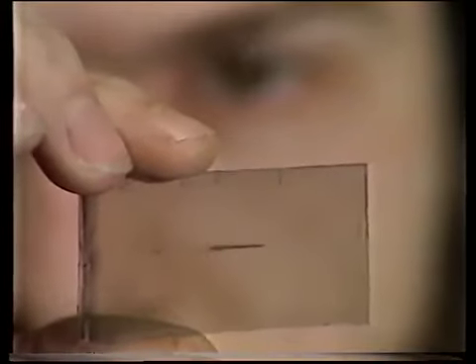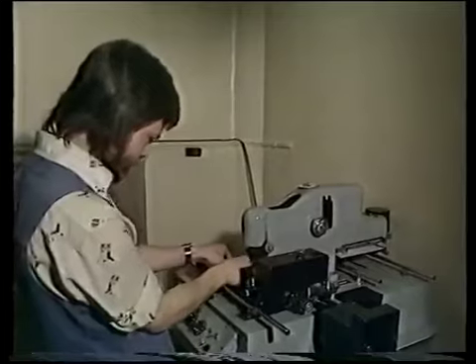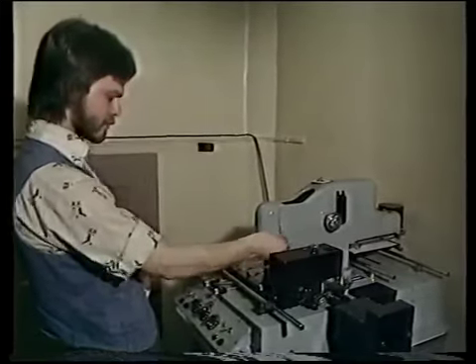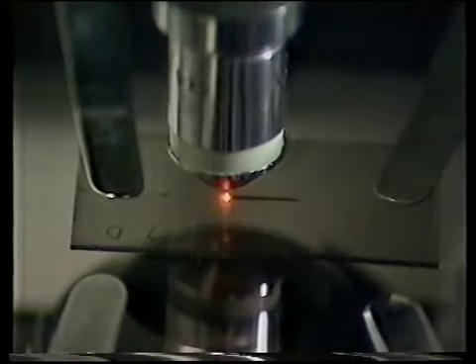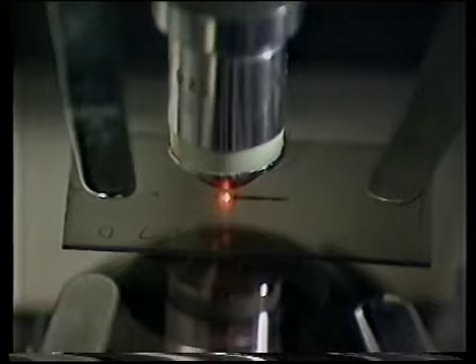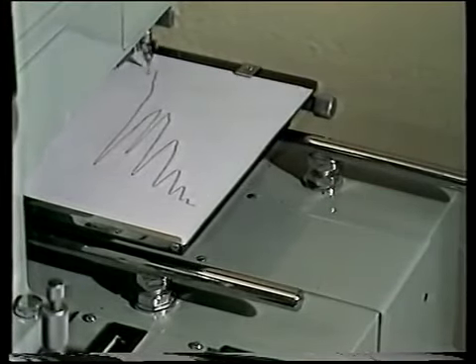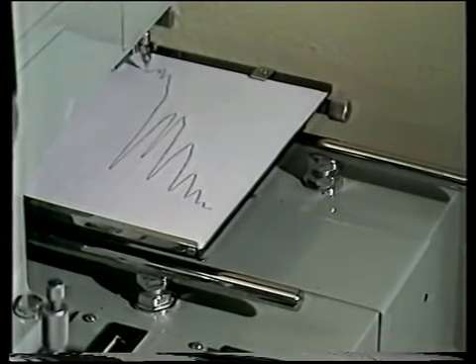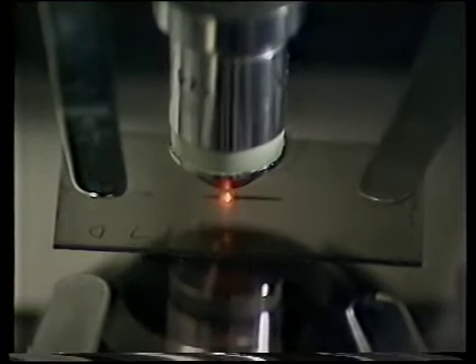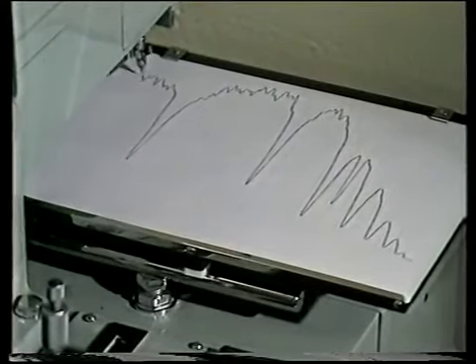The original spectrum was recorded on this glass photographic plate. With a densitometer, we can measure the intensity of each line in the spectrum by passing a thin beam of light through the plate and measuring how much is absorbed. By recording this, we get the intensity of each line in the spectrum. From these intensities, we can more accurately calculate the temperature of the star.